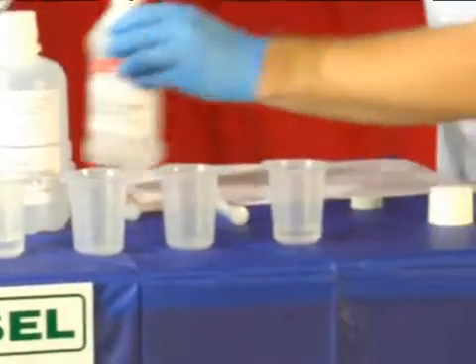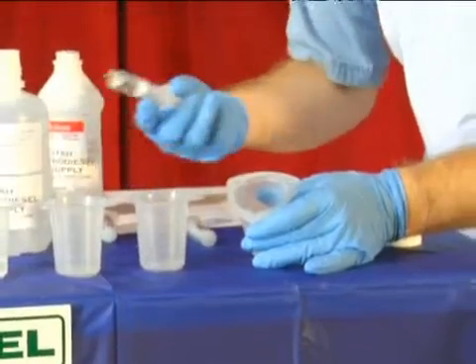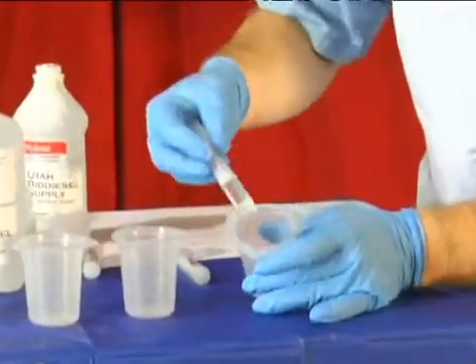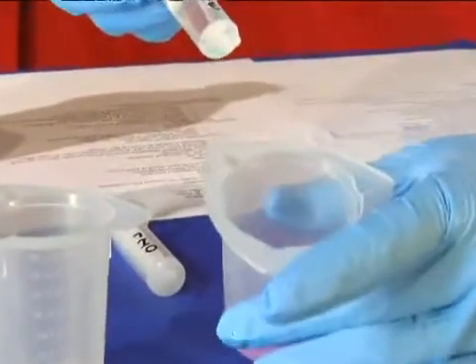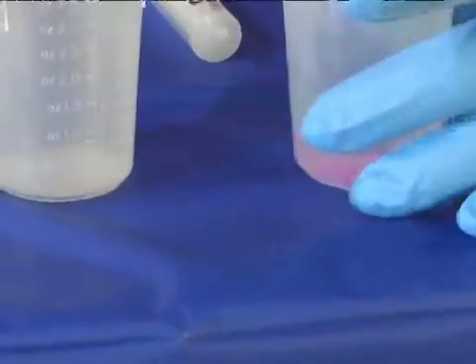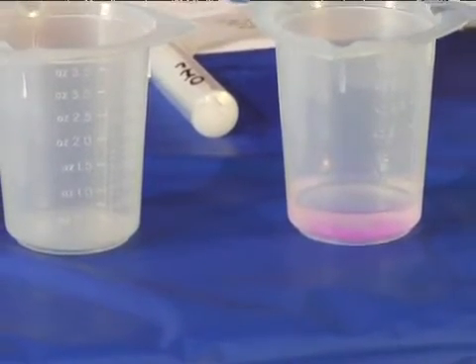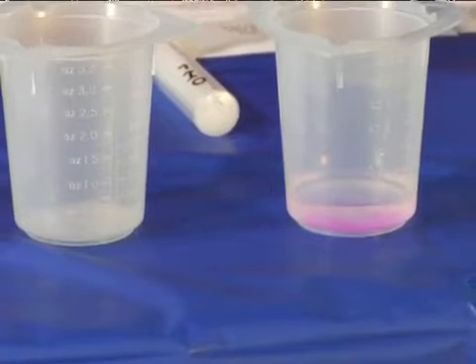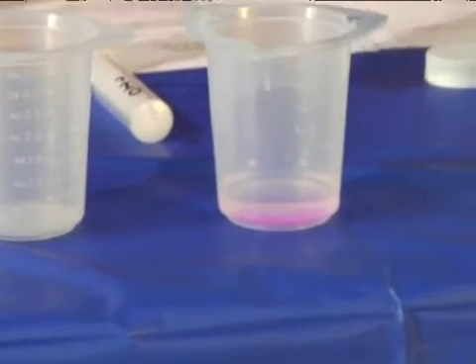Now what we're after is just starting to turn this pink by adding just a touch of this. I'm going to squirt just a few drops and you'll see it just barely turned pink. By adding a basic solution to alcohol, this pH indicator shows that the alcohol is not acidic — it means it's perfect for making biodiesel.